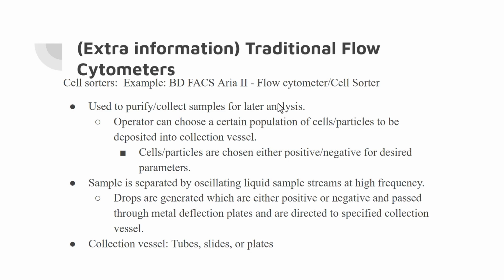This sample will be separated by oscillating liquid sample streams at high frequencies. Drops are then generated, which are either positive or negative, and will be passed through metal deflection plates and then are directed to specified collection vessels. And the collection vessels can either be tubes, slides, or plates.